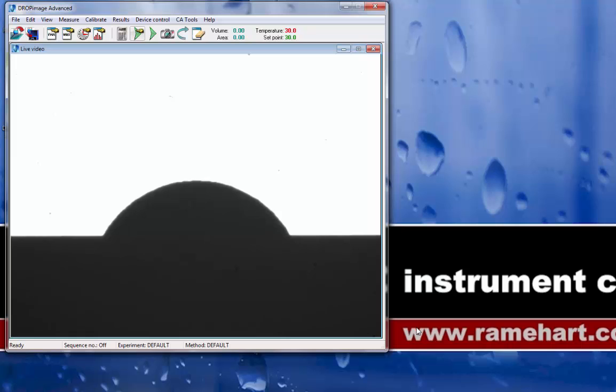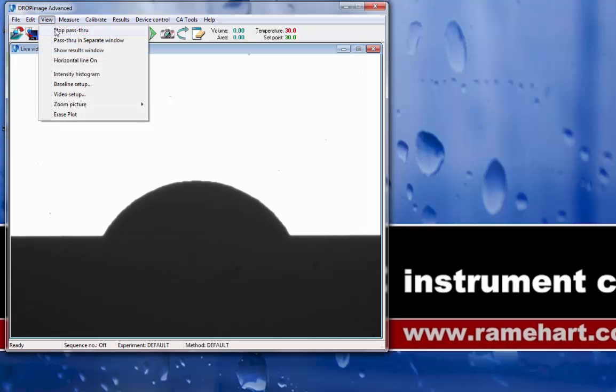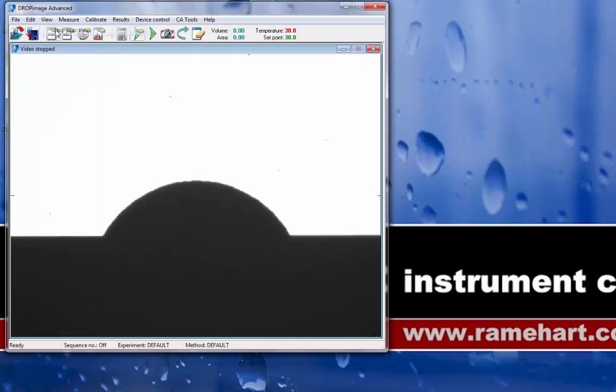In order to restore the separate window, I'm going to go back to the pull-down menu under View, and first stop my pass-through in the main window.